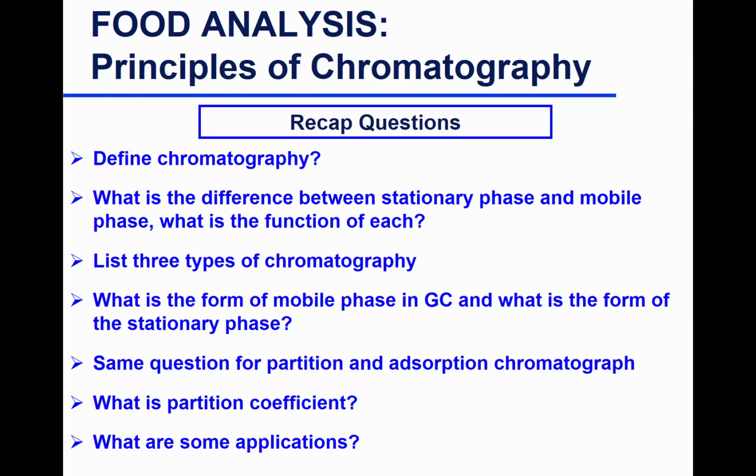It's a separation technique used in food analysis. We use it for many different applications. We will be talking about many applications throughout the semester. You'll see, when we go into the carbohydrate chapter, there will be a lot of chromatography. When we go into the fat characterization, protein characterization, contaminants of concern, we're going to bring back concepts of chromatography and look at applications. So now what we're doing is learning the principle, and throughout the semester we'll see applications.